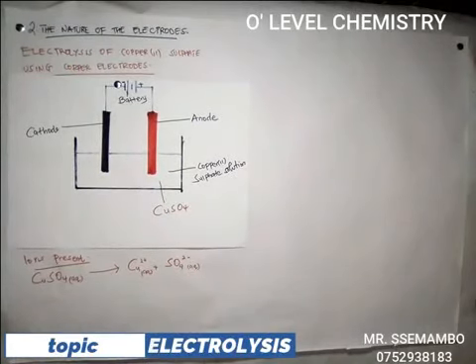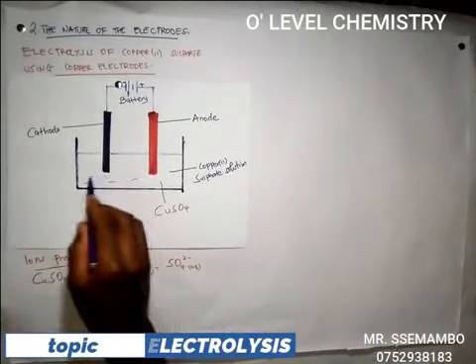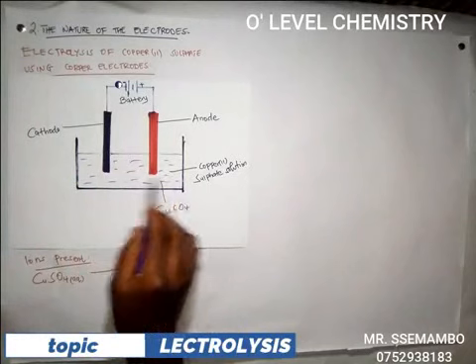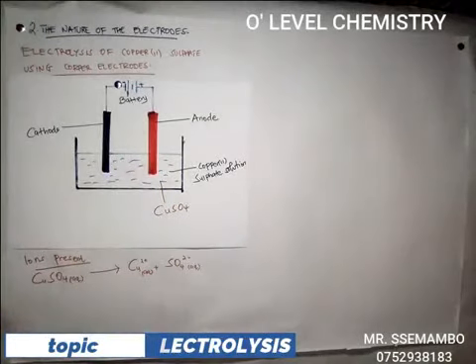Due to the presence of the copper II ions, this solution is blue in color. So we have a blue solution here in our beaker.